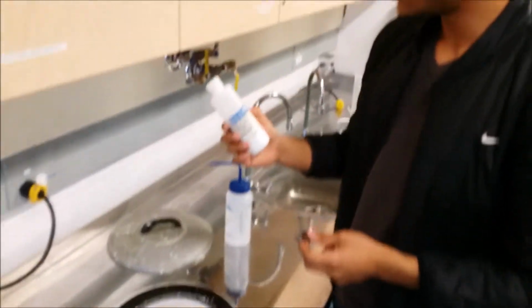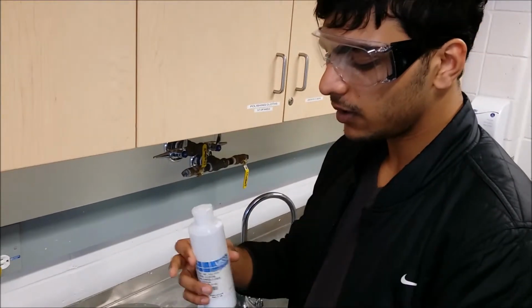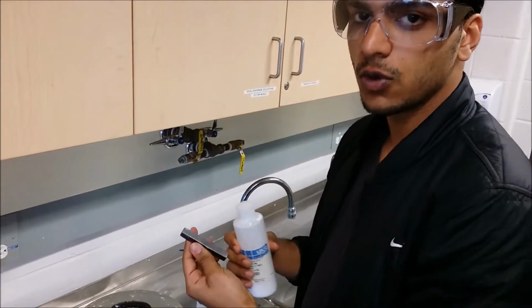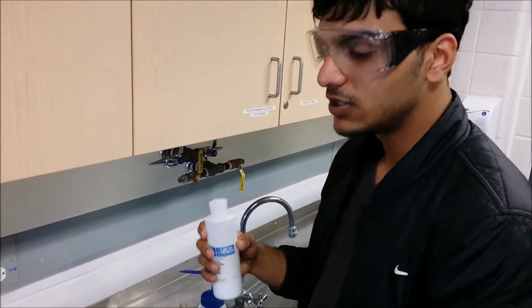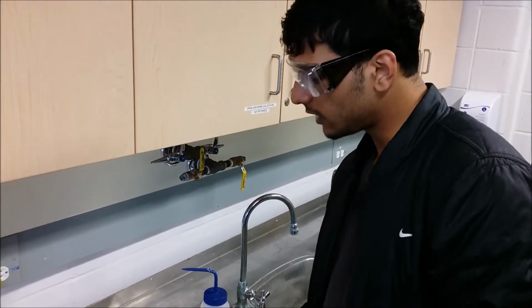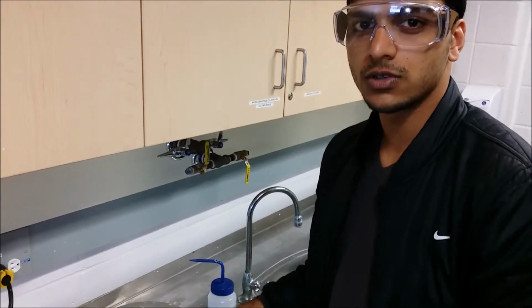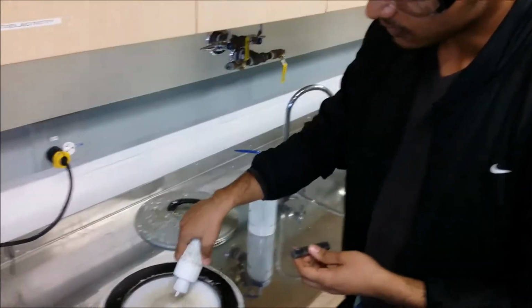Then we add some of this polishing agent, alumina, so that we can have a finer mirror finish over the surface, so that we can see our own reflection in it. Like I said, to reflect the light of the microscope to a greater extent so we can have high resolution images. A small amount of it.